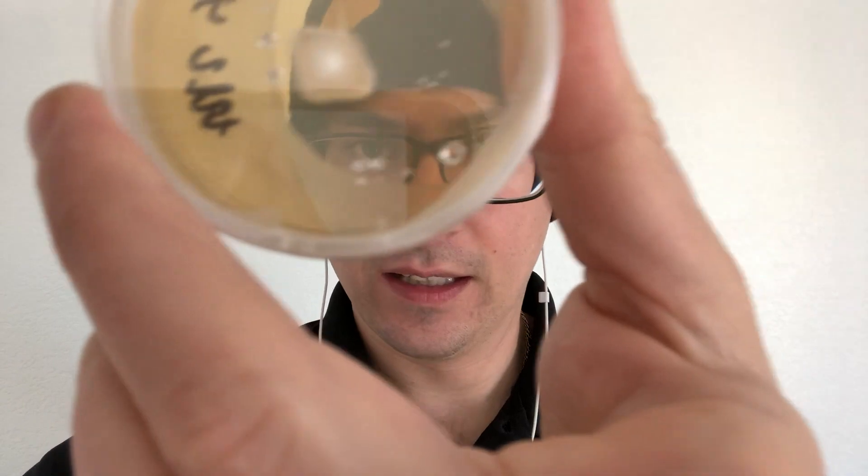The chestnuts — I've got maybe about six isolates from one of the chestnut plates, and these are starting to take off. Chestnuts are a little bit slower growers, so these ones will probably take about a week to grow out.